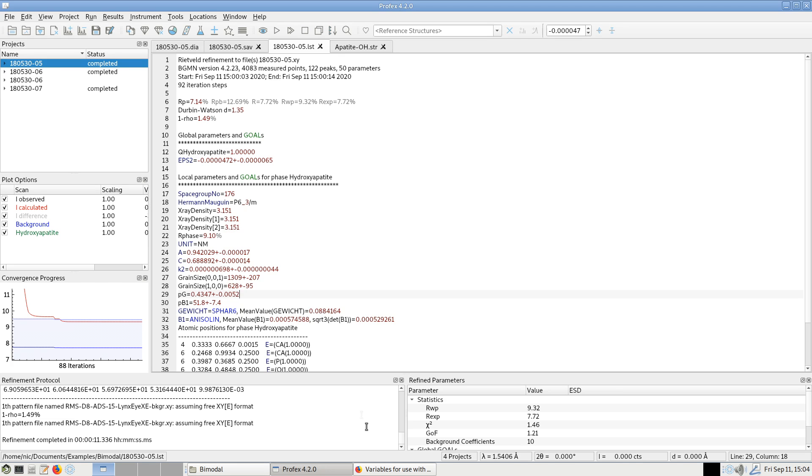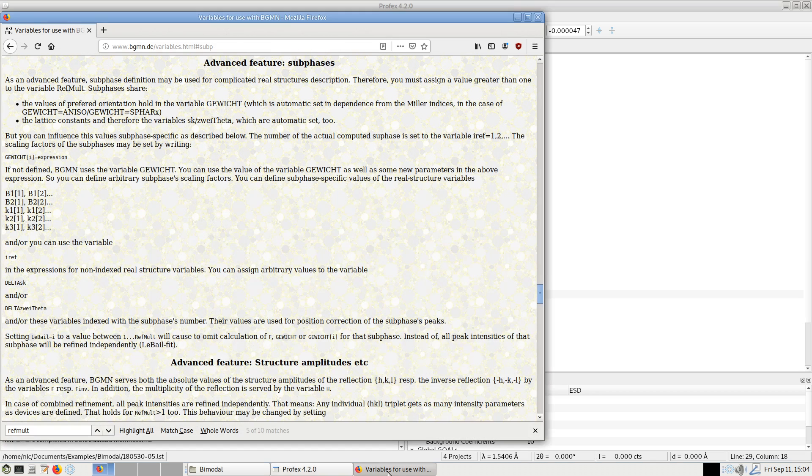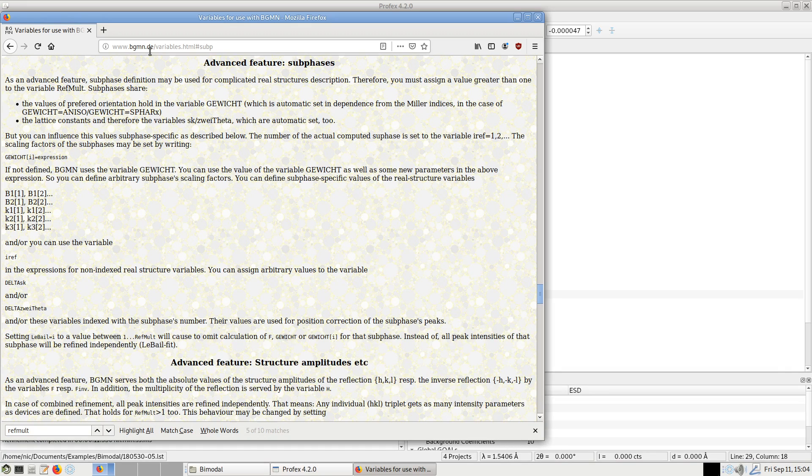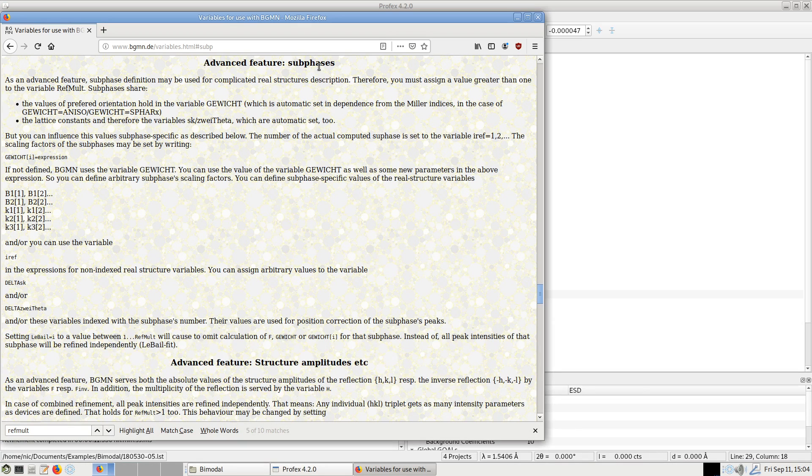If you want to know more about sub-phases, I suggest you go to the bgmn.de website to the section Advanced Features Sub-Phases and read what it says here.